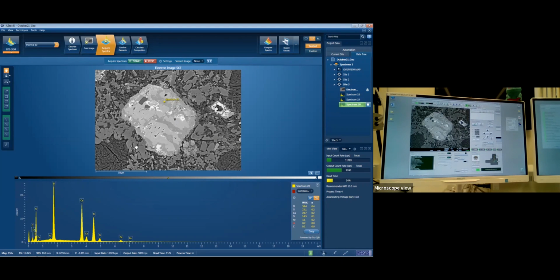You'll also notice we've got this nice flat looking mineral over here, like there's no real texture to it, or we compare that to this stuff down here. That's because different minerals have different hardnesses. So when we're polishing these flat, which we need to do to get the backscatter and the EDS to work, different minerals fall apart in different ways.